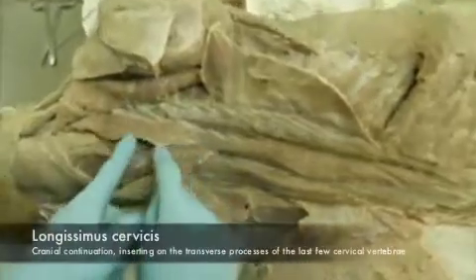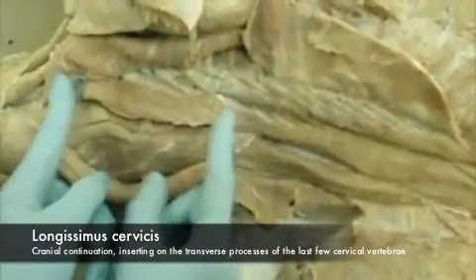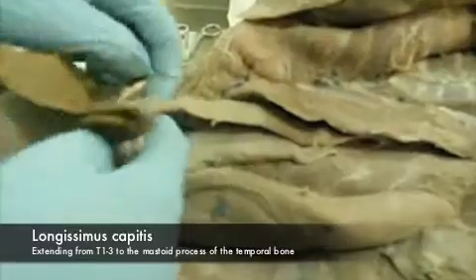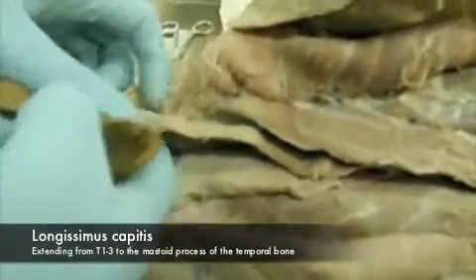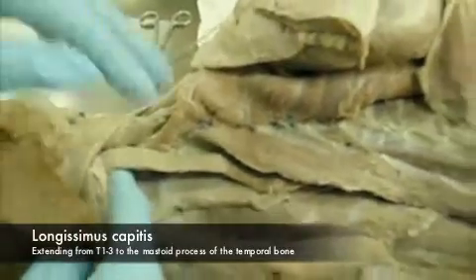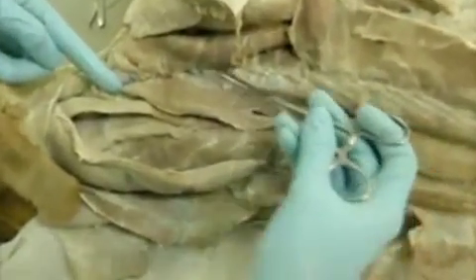After the thoracis, we have the cervicis. This is where it gets a little complicated. Cervicis, and then the capitis, which is this flap-like muscle, flat, and goes to your head. Okay, so this is the cervicis. You can kind of tell it apart because it fans out a little bit. So you can see that.